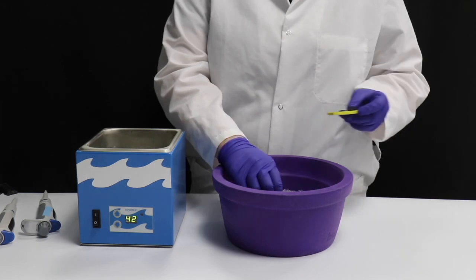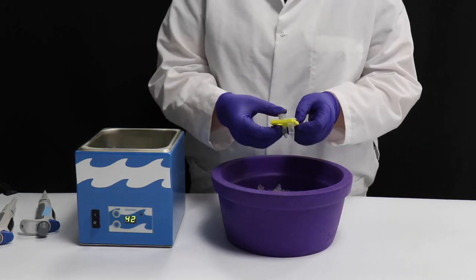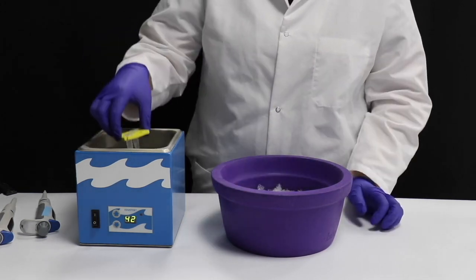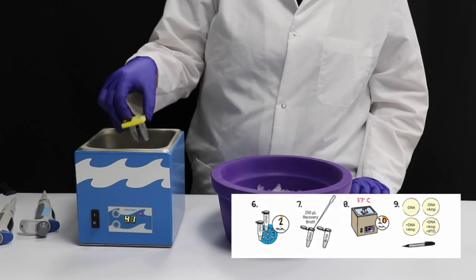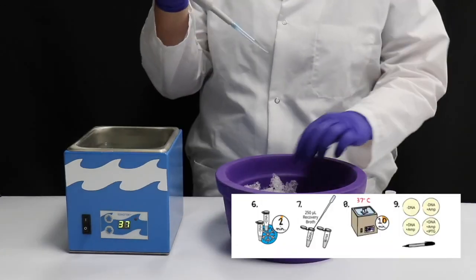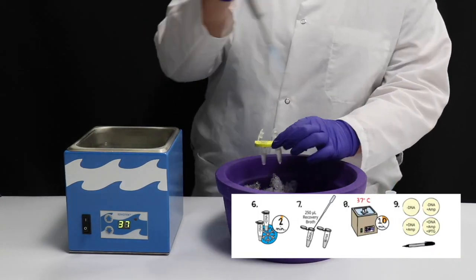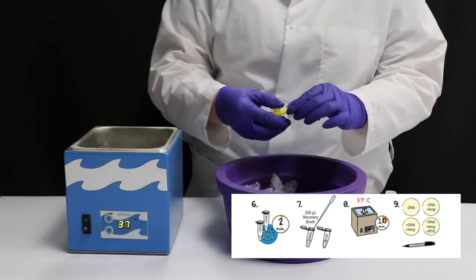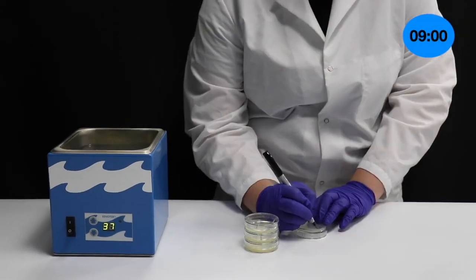Place the transformation tubes in a 42 degrees Celsius water bath and incubate for 45 seconds. Immediately transfer the tubes to ice and incubate for 2 minutes. Add 250 microliters of recovery broth to each tube and invert the tubes to mix. Incubate in a 37 degrees Celsius water bath for 10 minutes.